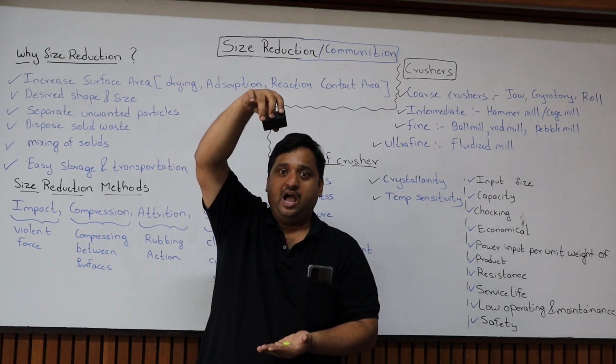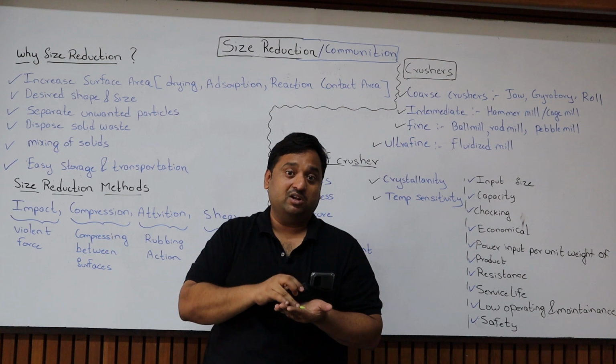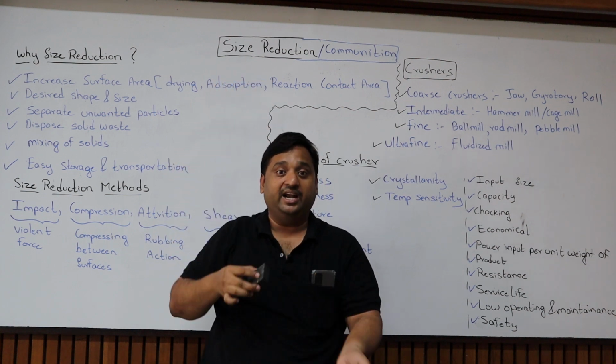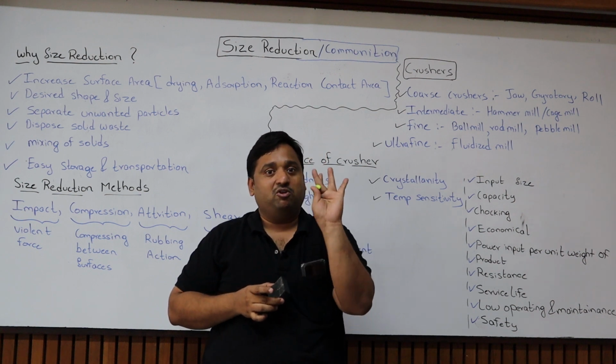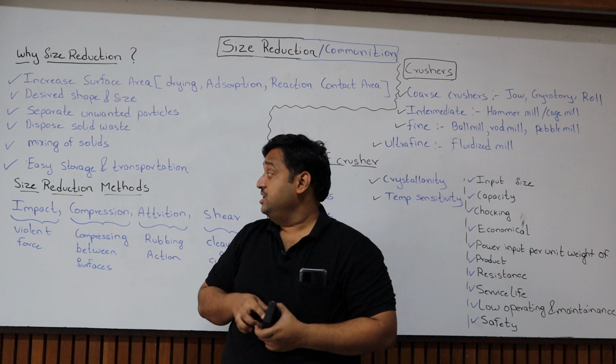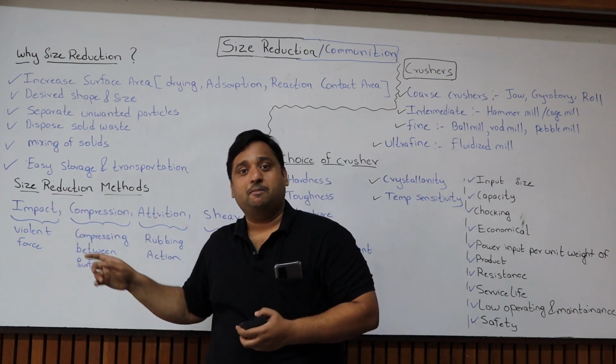What I do is, I drop this material on this smaller particle. Because of the impact force on the particle, it will get crushed. It's called a single violent force application on the particle. That's called the impact.